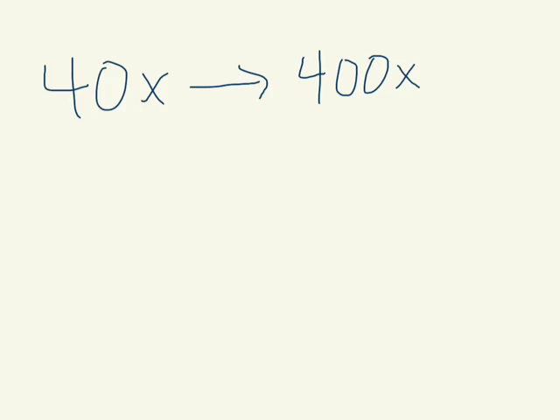So now let's talk about how these two, magnification and field of view, are related, and why we might mix some of these up. As we zoom in on a specimen, we are increasing the magnification from, let's say we go from 40 times to 400 times. What did that increase by? 10 times.